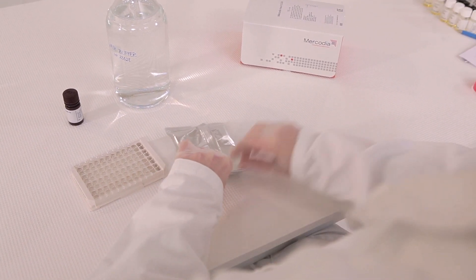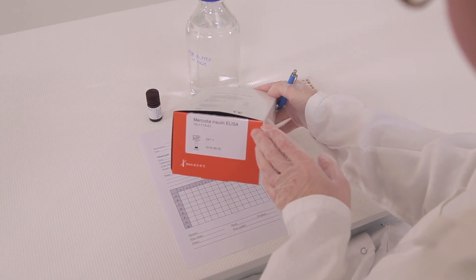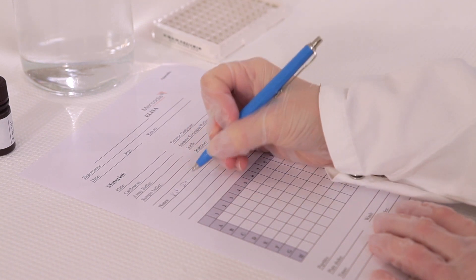It is useful to have a worksheet to plan and record details about your run. Note the lot number for the kit and designate wells for the calibrators, controls, and samples.